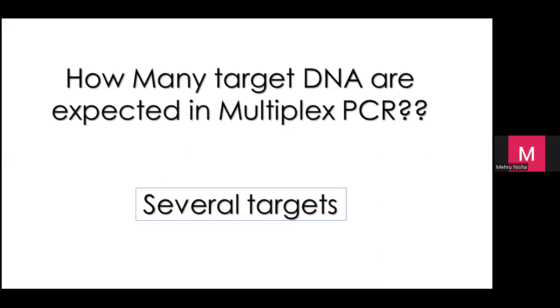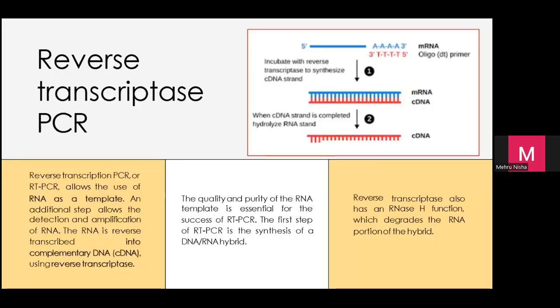Several targets. Many, not only one, several targets. Okay. The third, you call it reverse transcriptase. Reverse transcriptase PCR. Kalau pelajar tengok, PCR ini adalah DNA base. Kita ambil DNA, lepas tu kita buat PCR.